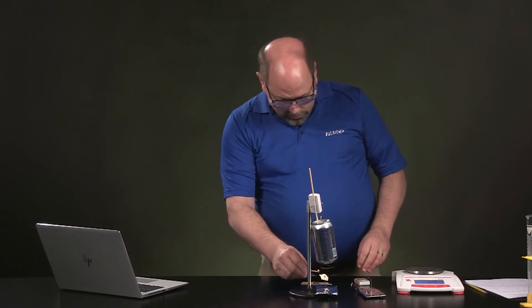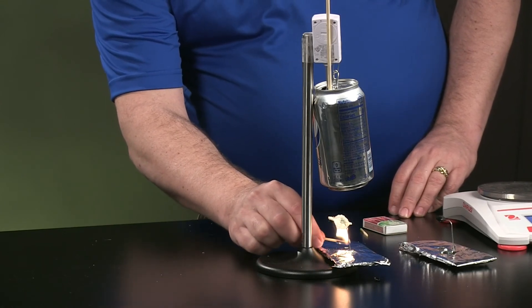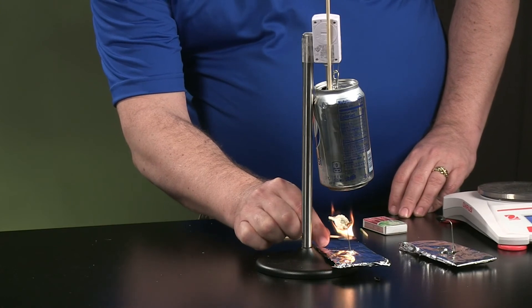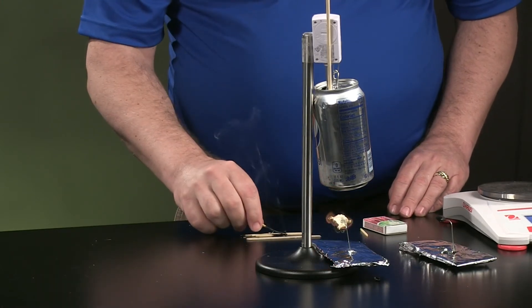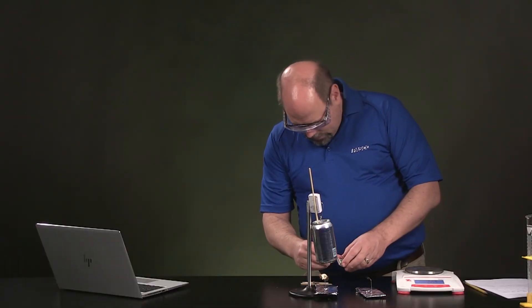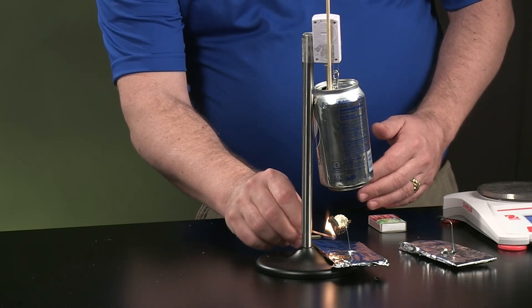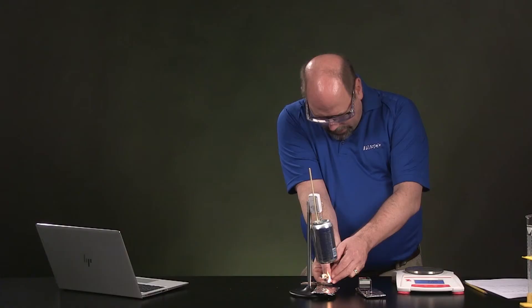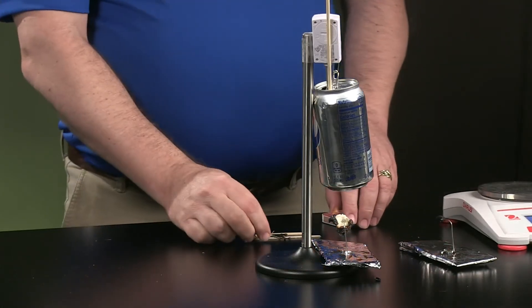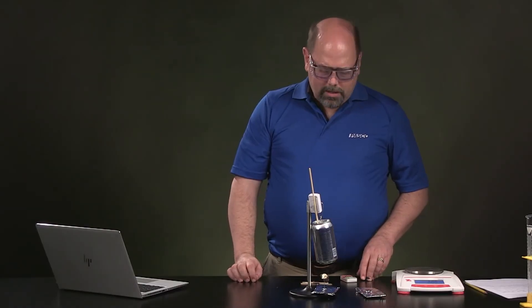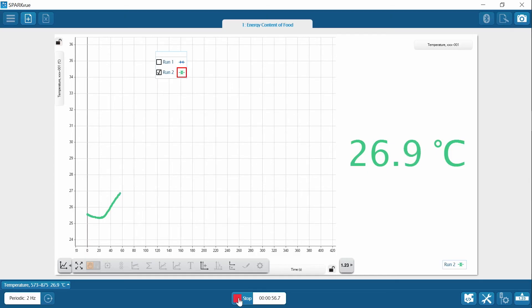And this one should be able to start pretty quickly with just the match. Try to start several places so that it turns as evenly as possible. I'm trying to get just a little bit more on this backside that hasn't burned at all. Not that you have to get the whole thing to burn. You just want some of it to burn. But if it hardly at all burns, it may not weigh as much.